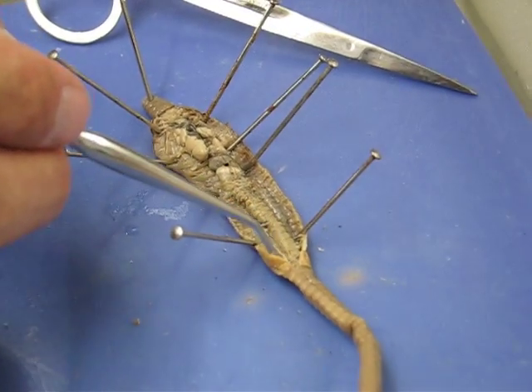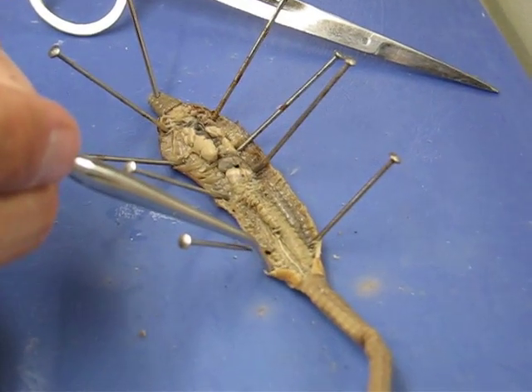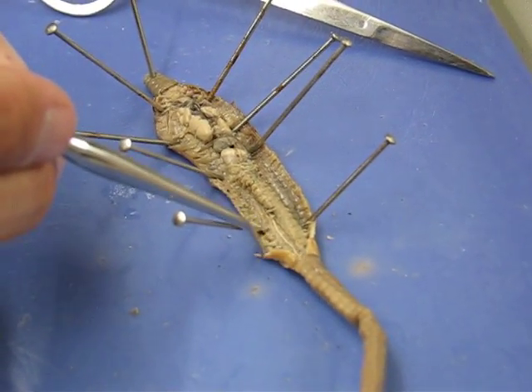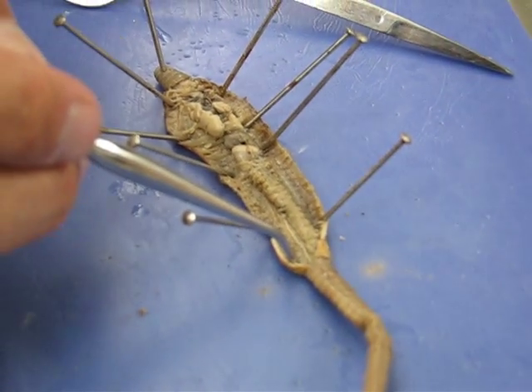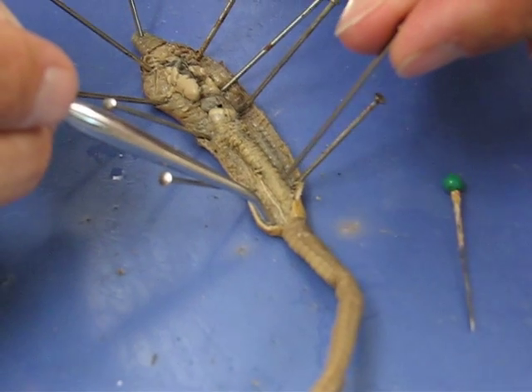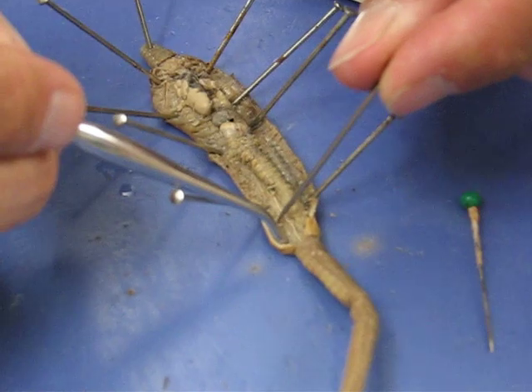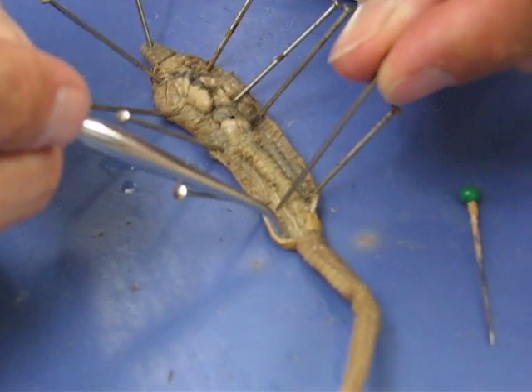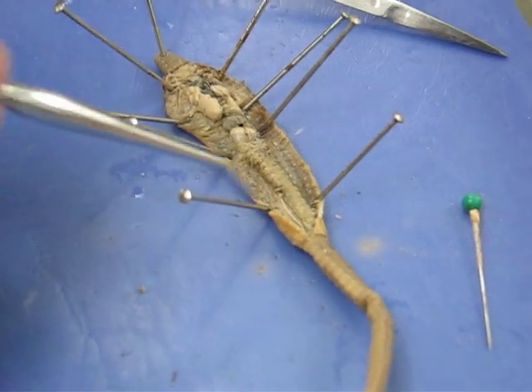The nephridia are going to be these little tiny things right here. They're hard to see, but you can see the septa there between each section right there and right there. The nephridia are these little tubes right in between there. Each little segment will have one.